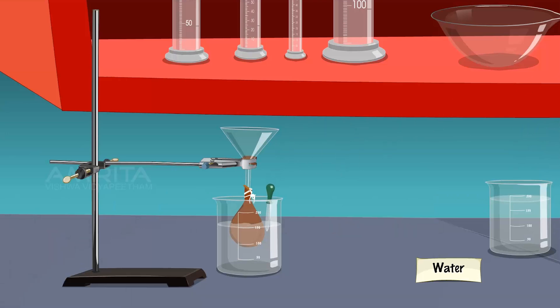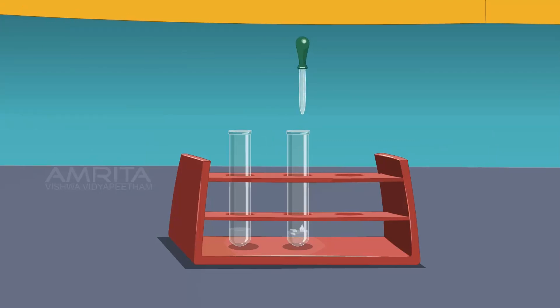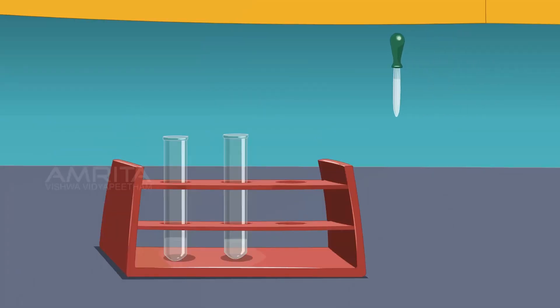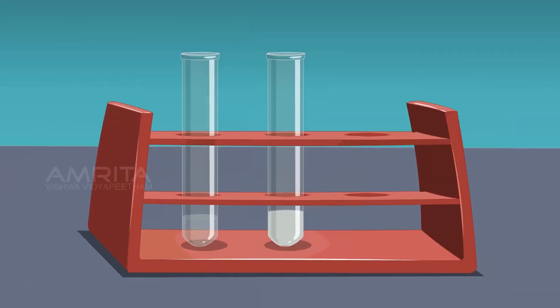Withdraw another 1 ml of water from the beaker and transfer it into another test tube. Take a few drops of silver nitrate solution using a dropper and add it into the test tube containing water. A white precipitate of silver chloride produced immediately indicates the presence of chloride ions and hence sodium chloride in water. It follows that sodium and chloride ions diffuse through the parchment membrane. As sodium ions and chloride ions diffuse out of the starch sol, it gets free from ions gradually.